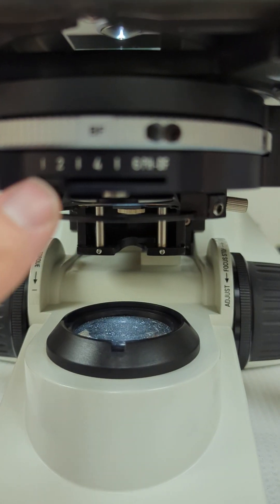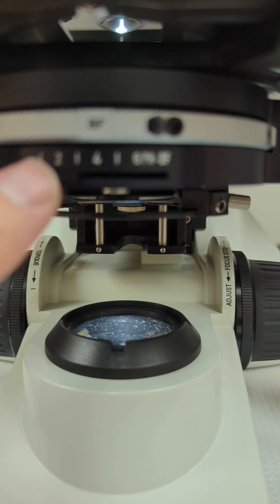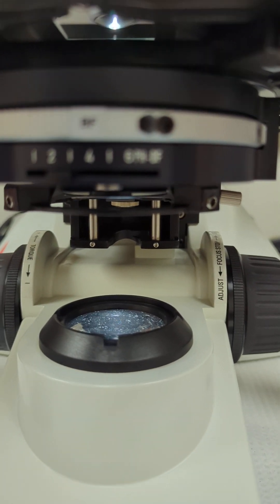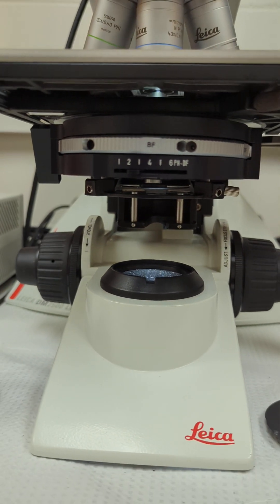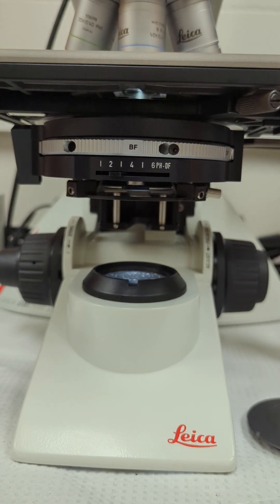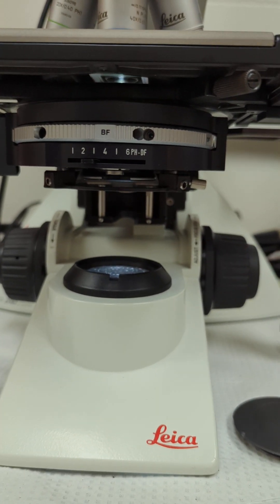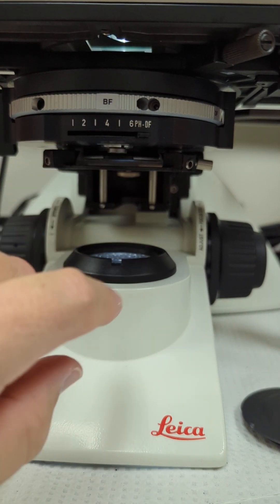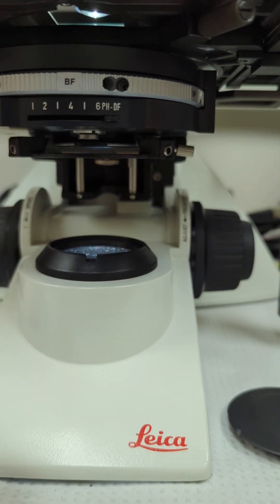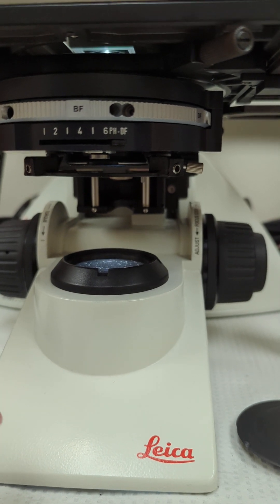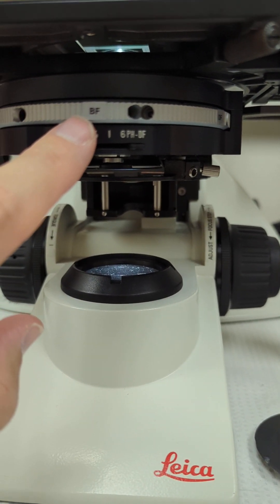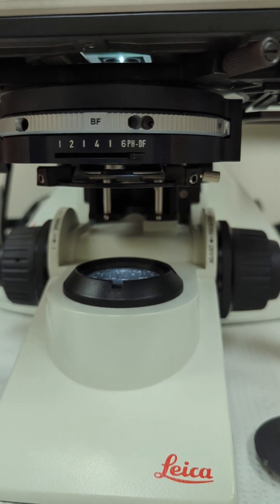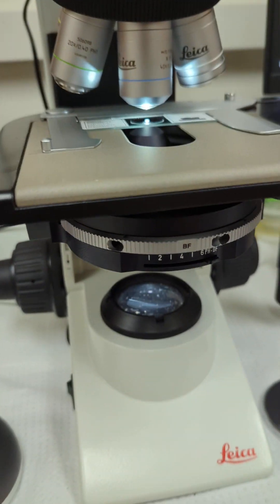These are just optimal brightfield settings. They're not set in stone, I should say, so you can move this lever back and forth to your heart's desire until the sample or whatever you're looking at looks great. If you're in phase or darkfield, it goes all the way over to the right and just stays there. Only the BF position is when you would use these numberings.